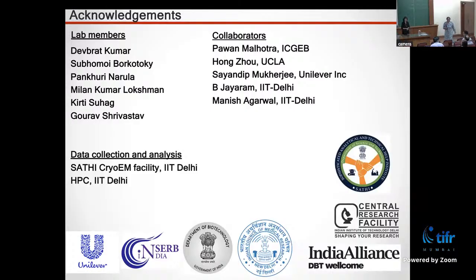Thanks. Fascinating talk, actually. Such beautiful images of these viruses. I just want to get back to the MD simulations of the viruses, and you got those free energies. I just want to get a sense of that. What's the size of the system? That looks humongous. Yeah, it is some 6 million atoms. Wow. And that in solvent. Yeah, you actually put solvent around it. Yes. So it took a long time. Yeah, but how did you get the free energies out? The free energy barriers that you mentioned?